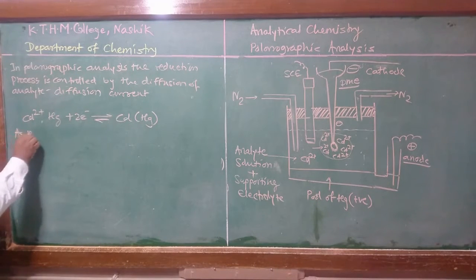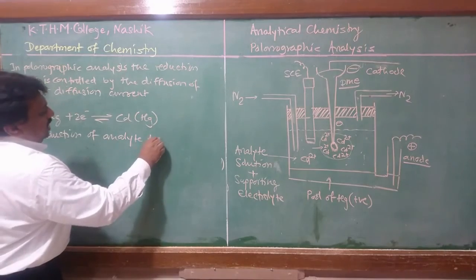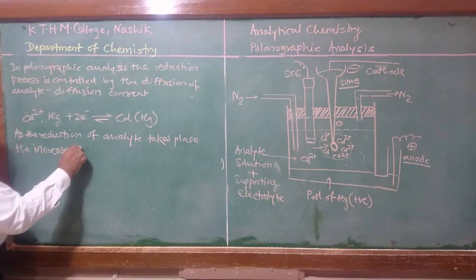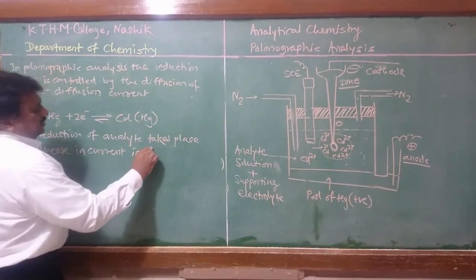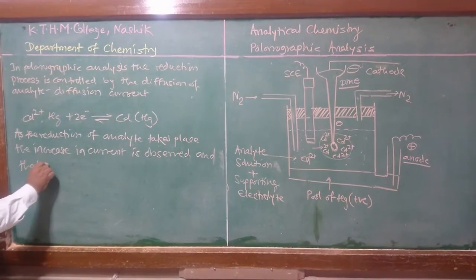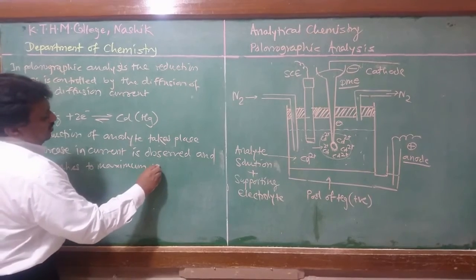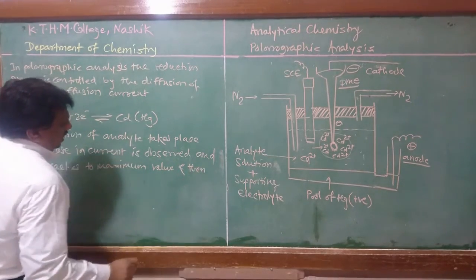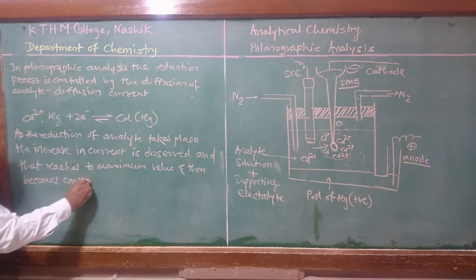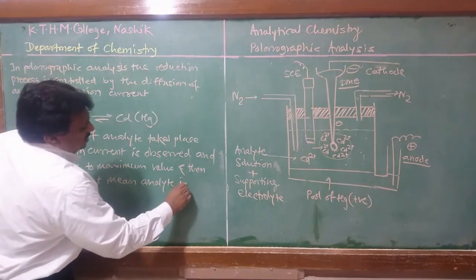Then, as the reduction of the analyte takes place, the increase in current is observed, and that reaches a maximum value and then becomes constant, which means the analyte is completely reduced.